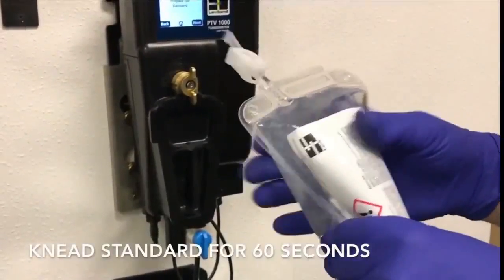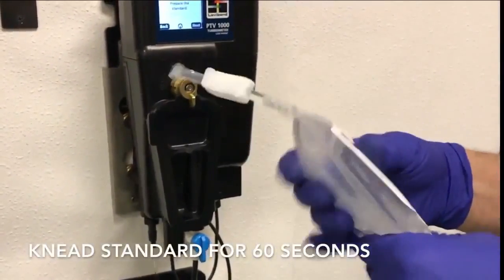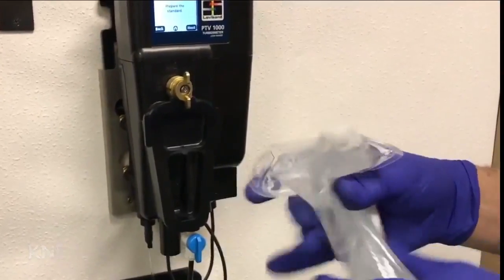Knead the standard for 60 seconds. This will help equally distribute the contents. Please do not shake or invert the TCAL Plus standard.